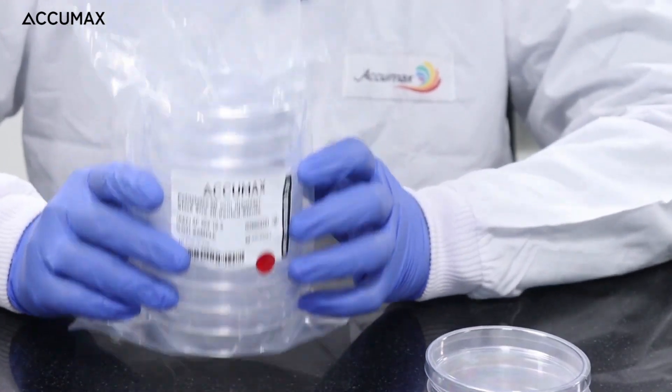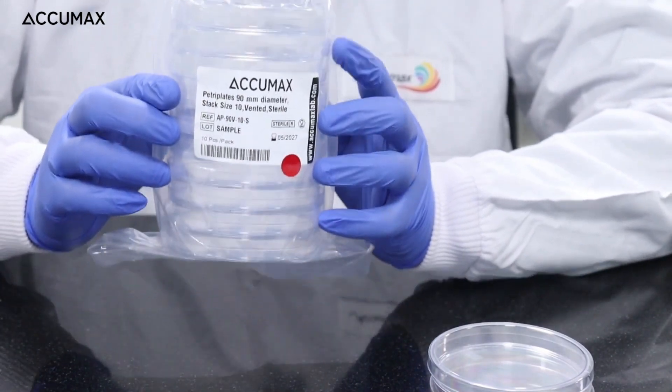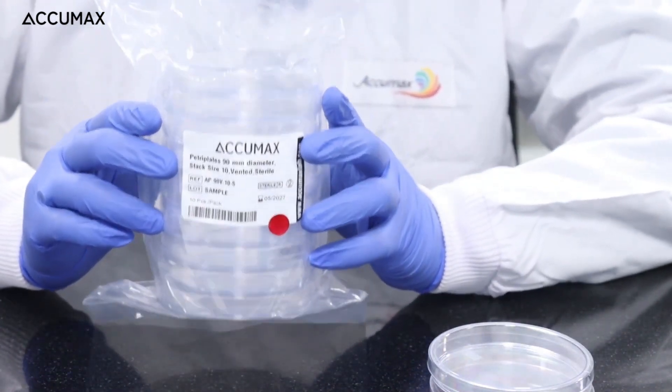There are two packing options available. Accumax petri plates are available in the sleeve of 10 plates while it is also available in the sleeve of 20 plates.